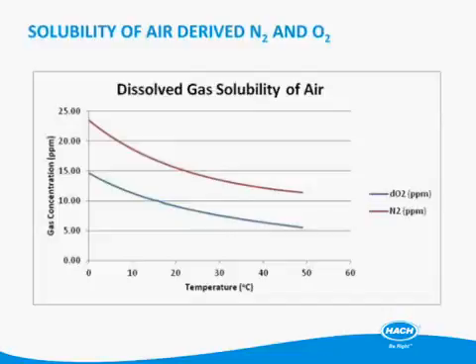I just wanted to go back and do a quick review of solubility of air in a liquid and just show the relative solubilities. So just to go back and correlate what was different about the magenta line in the previous gas, it was the 60% to 40% ratio of oxygen that dissolves in a liquid, and that would be why you would get that upper magenta line.